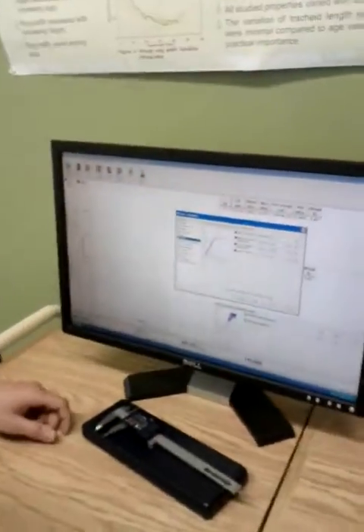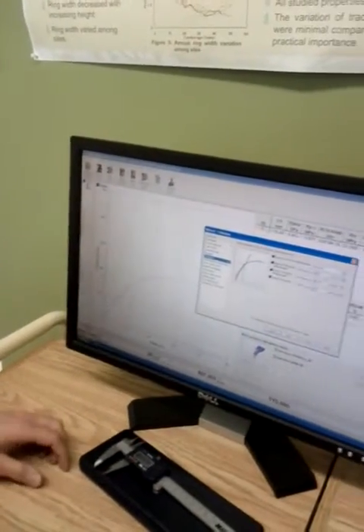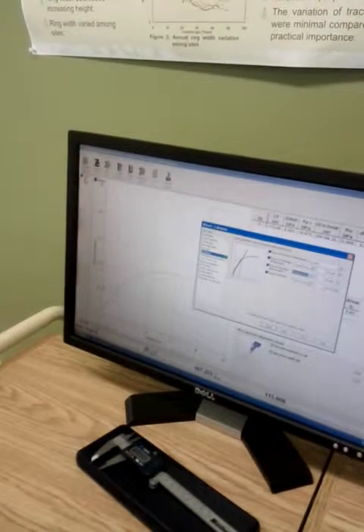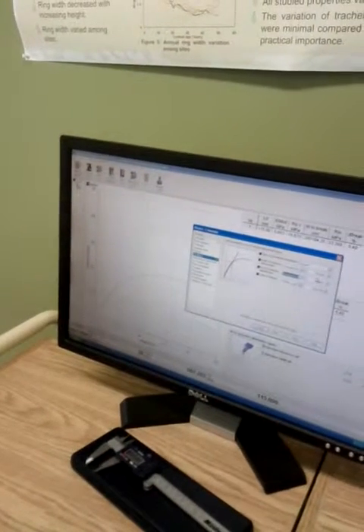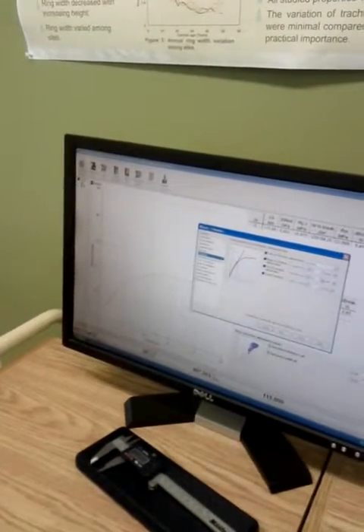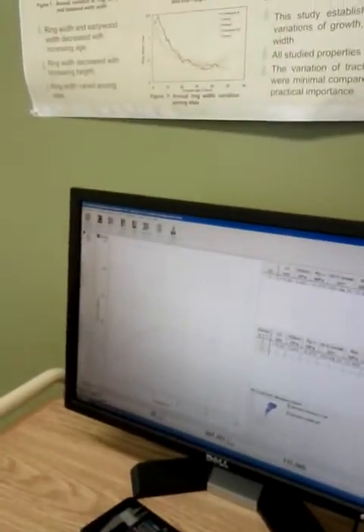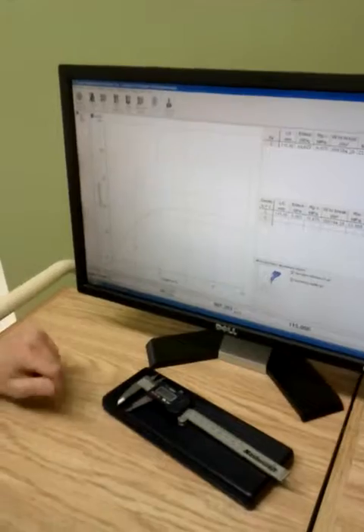So let's say I could put 4 and 10, and I would say 12, but it's up to you. It has to be in the linear zone. So the machine gives you the maximum amount of linear? No, you have to see. I say it's about here. You just guess. Yeah. Okay.